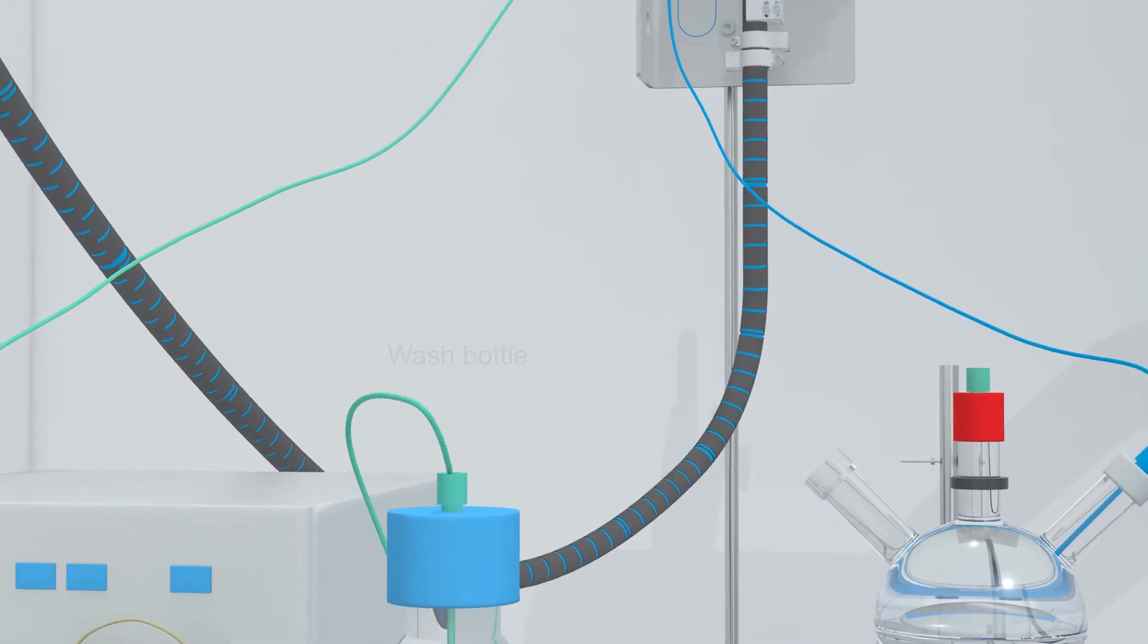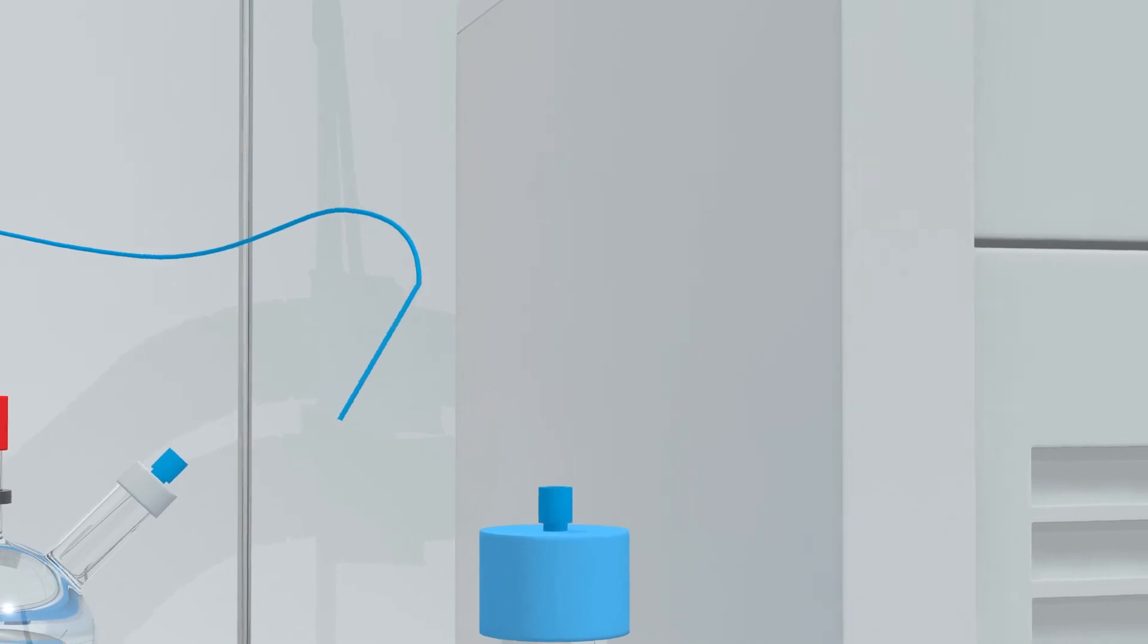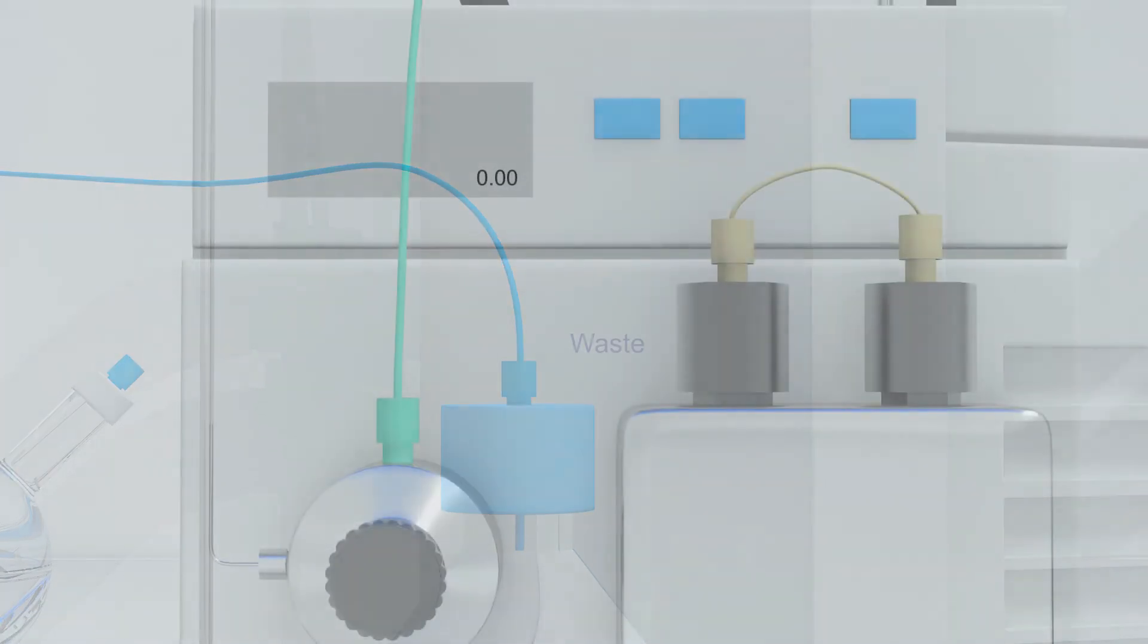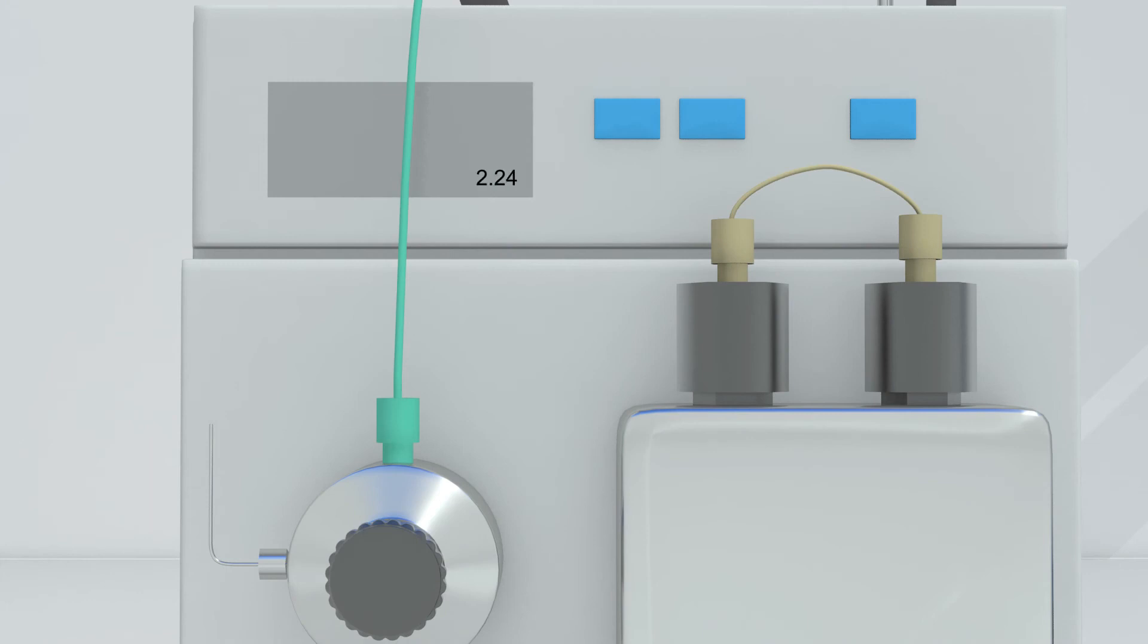Place it into a wash bottle with a suitable solvent and disconnect the sample return line from the reactor and direct it to waste. Switch the sample flow on and rinse the sample line with solvent. Switch the flow off once this is done.